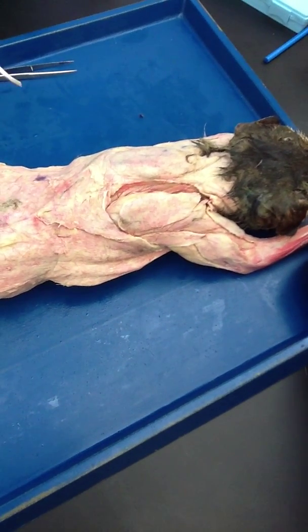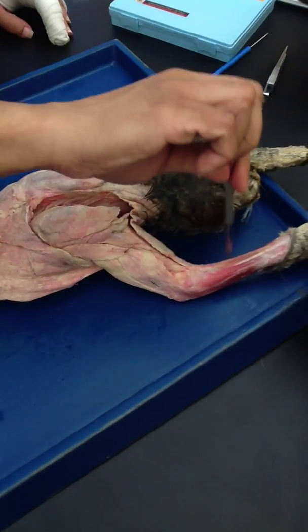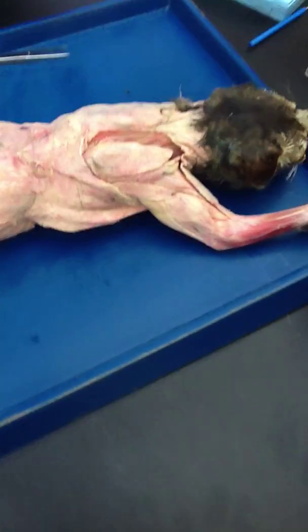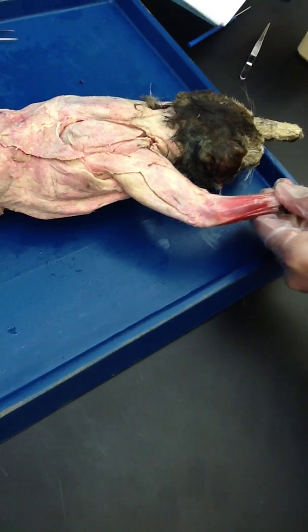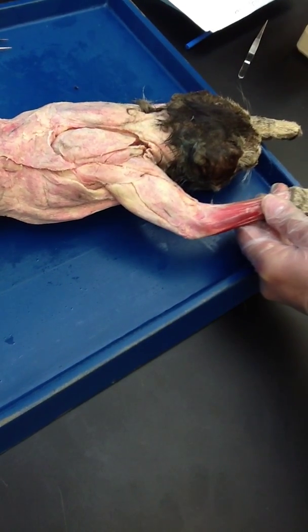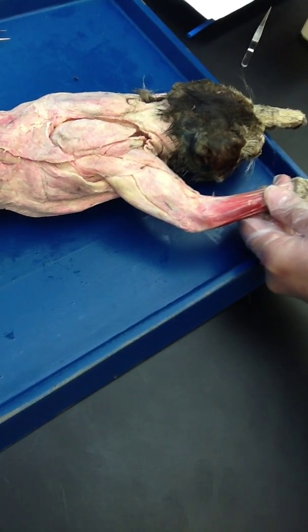Now we are going to start the backside of the arm, then we are going to do the anterior and posterior of the front leg of the cat. Now we are going to look at the deltoids. The deltoid in the cat has three parts to it, just like the trapezius. You see this right here? This is your clavodeltoid — we already covered that in the chest muscle.